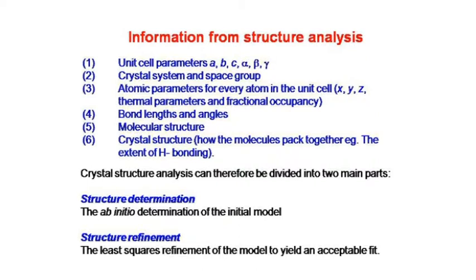So what I'll try and do is show you what the programs are doing, so it isn't such a black box. And so if you ever receive a crystal structure from somewhere, you will be able to say, oh, that's not quite right. Perhaps we need to do something.